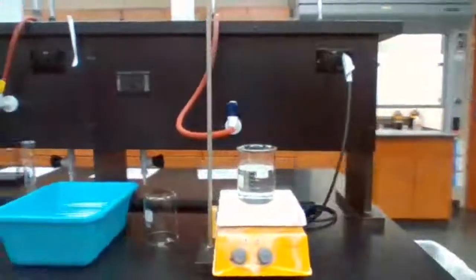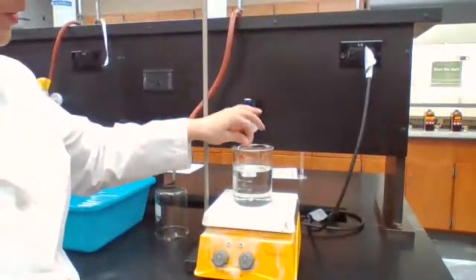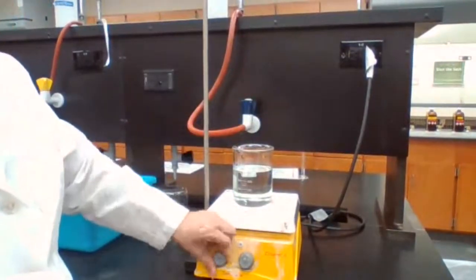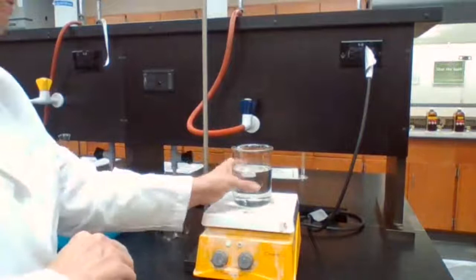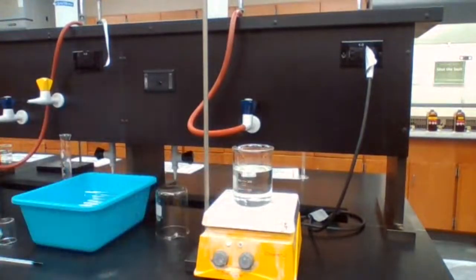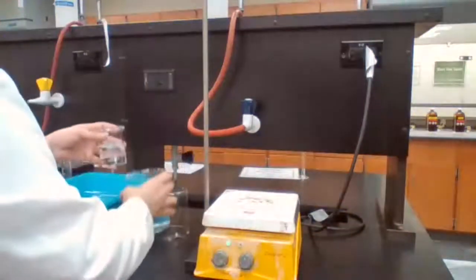The last step of the experiment is to find the boiling point of an unknown liquid. What is boiling point? Boiling point is the temperature at which a liquid changes to gas. We have to set up the equipment to measure the boiling point. The last page of the experiment shows you how to measure it. We're going to start by heating up water. This is a lot of water, so it's probably safer to use a small amount. Maybe it takes less time to heat up.